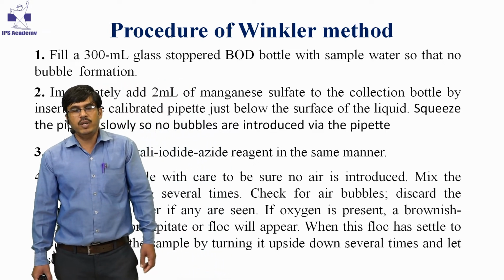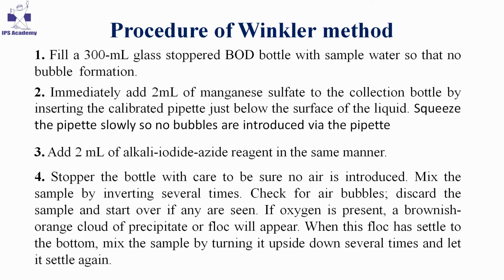We have to fill the bottle completely so that no environmental oxygen remains in the bottle. We have to take precaution that no bubble formation takes place when we collect the water sample.